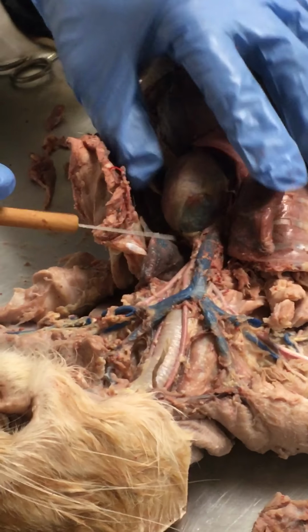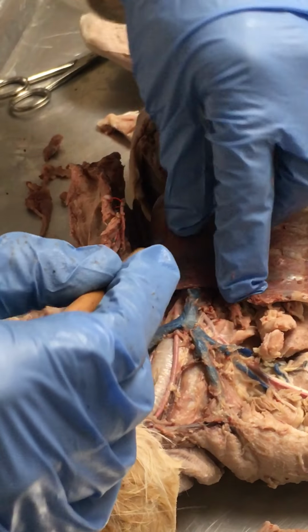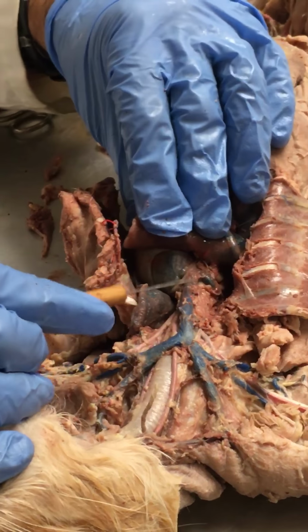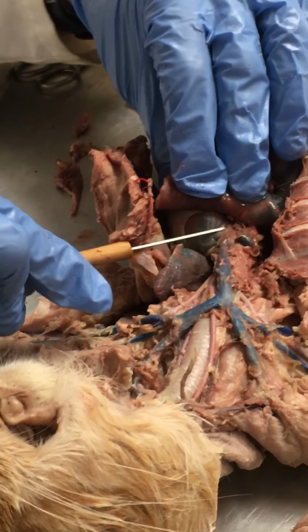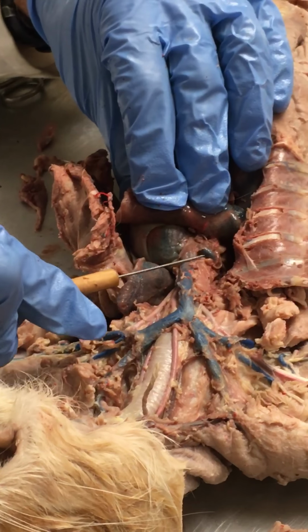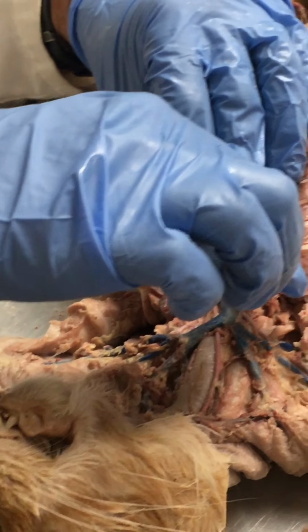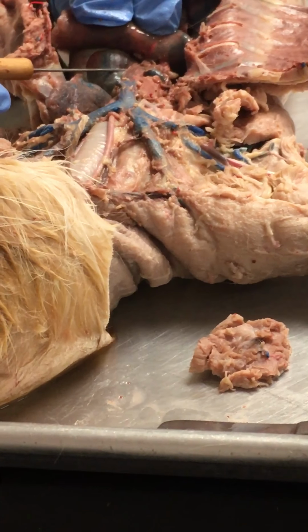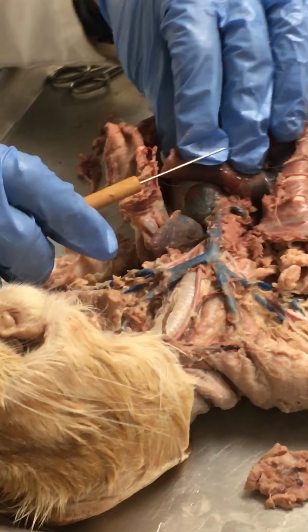The next one on there is the azygos. It's coming off of the superior vena cava, and to see it, we actually have to fold the lung this way. Be delicate with your lungs, they're fragile, but if we fold it back, we can see this large blood vessel that comes off the superior vena cava just before it enters the right atrium right there. So that is the azygos vein, and essentially it runs along the spinal column, but dumps into the superior vena cava just before it enters the right atrium. So that's the azygos vein. Have to kind of pull the lung back to see that one.